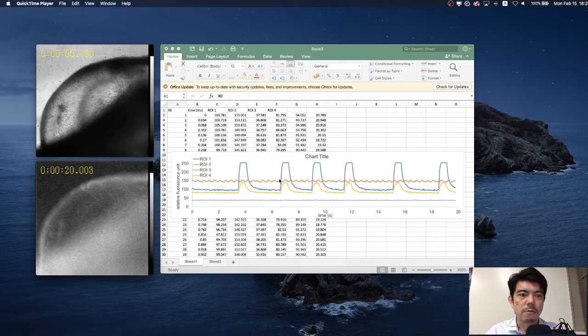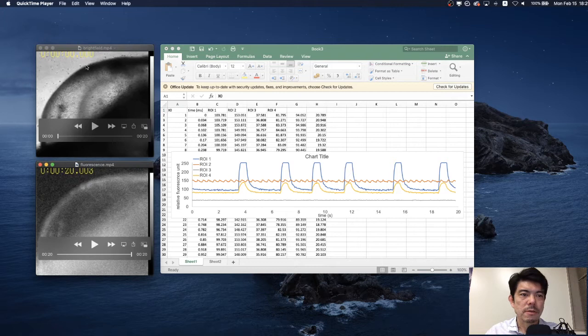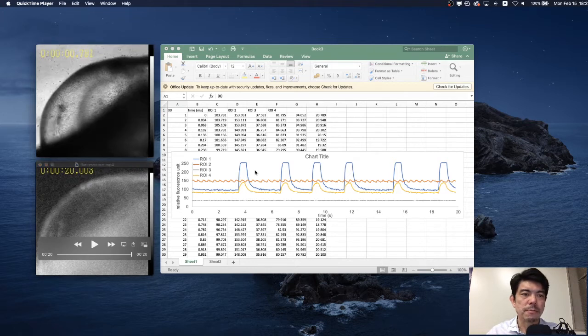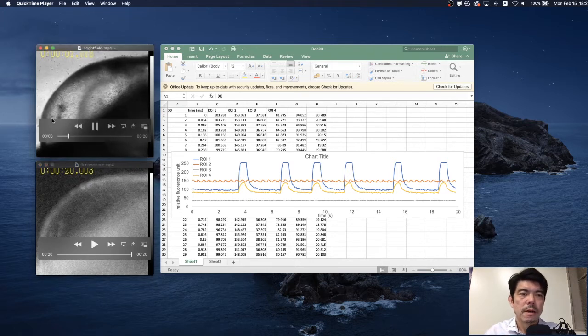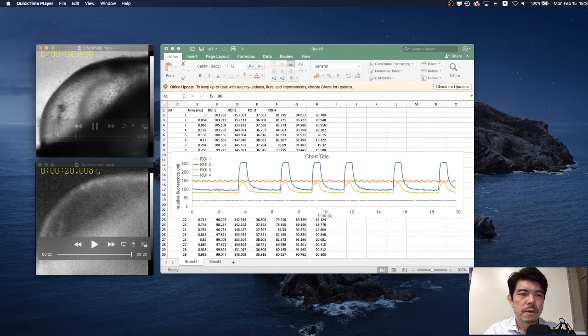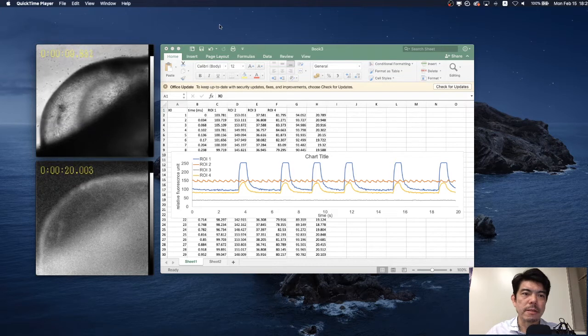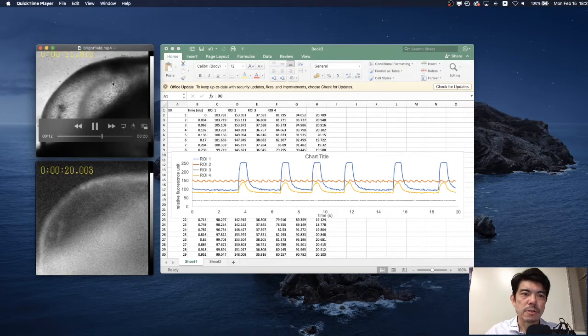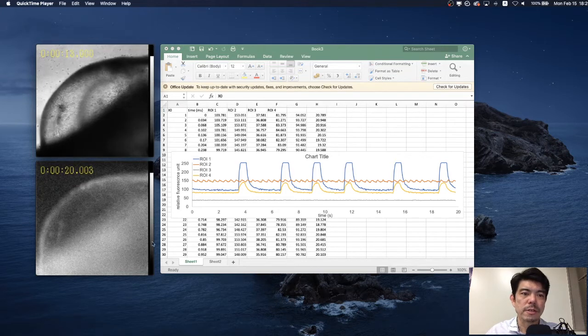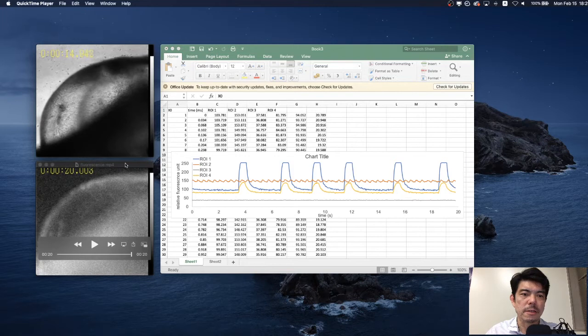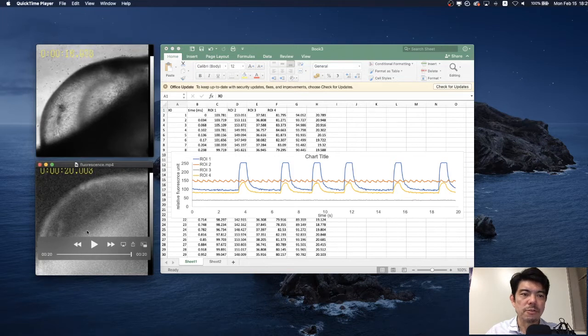Alright, so here is actually the bright field image of these IPS cells. Obviously we can see the spontaneous contraction here and we are interested in the fluctuation in the intracellular calcium level.